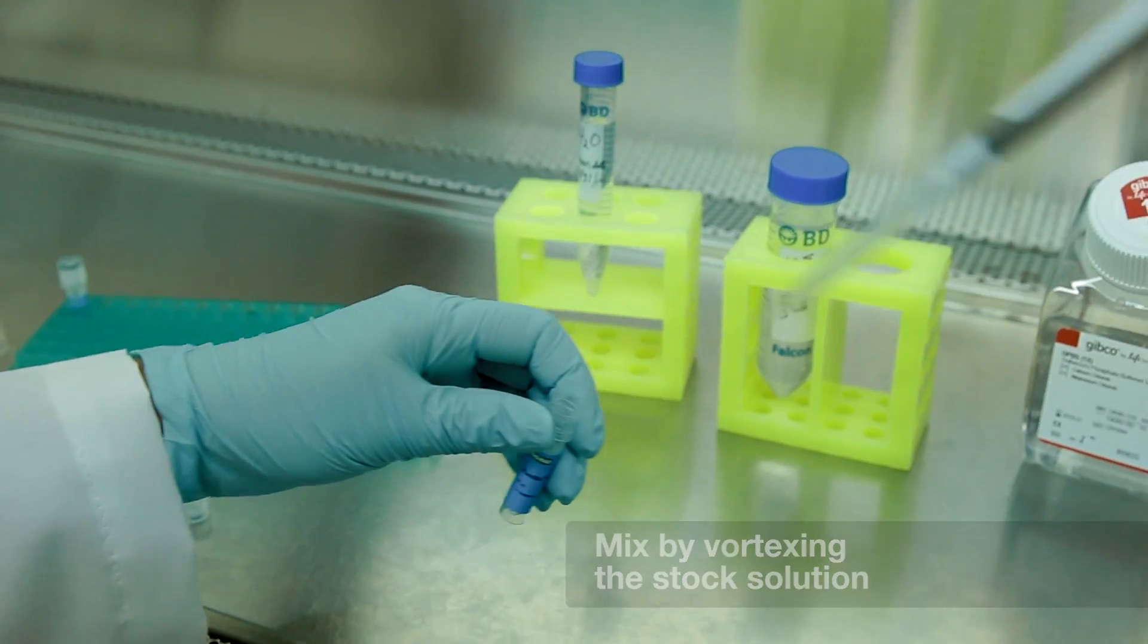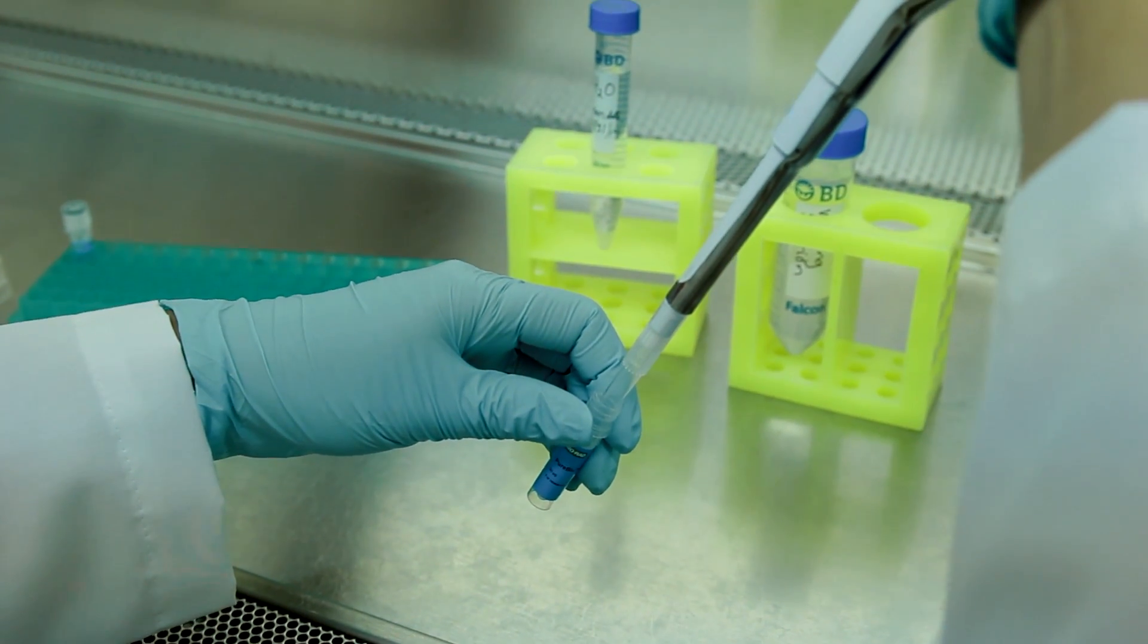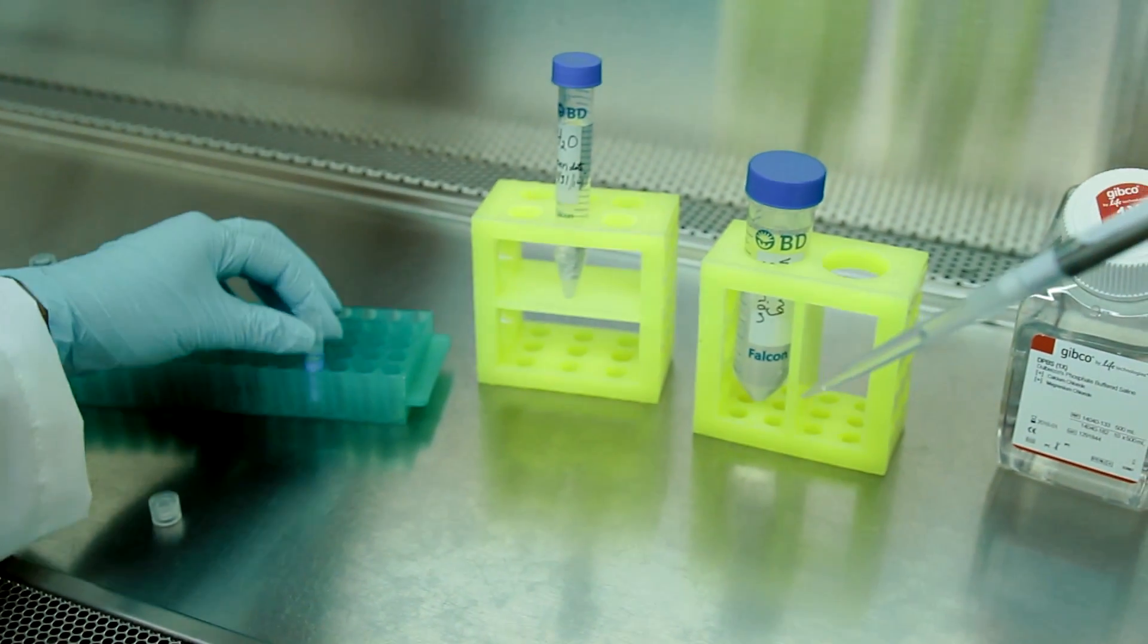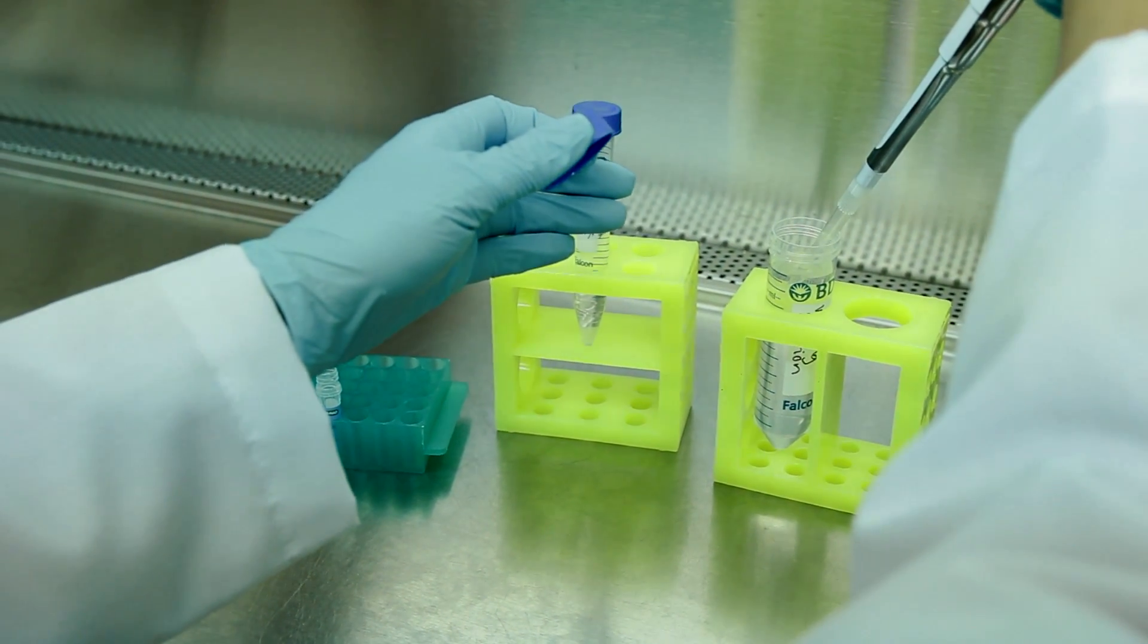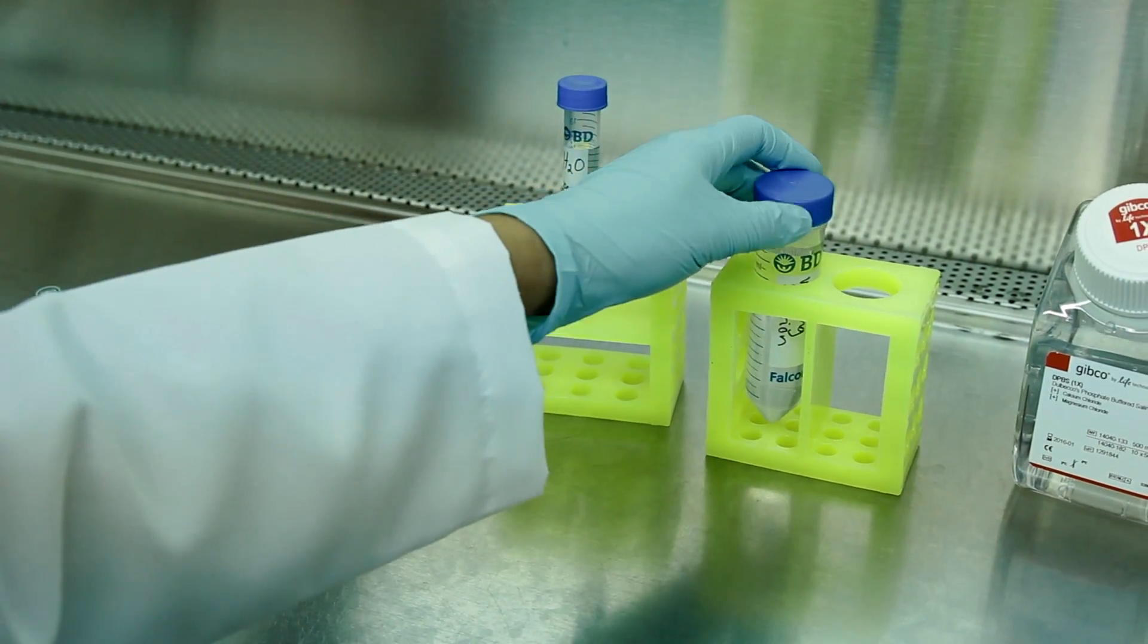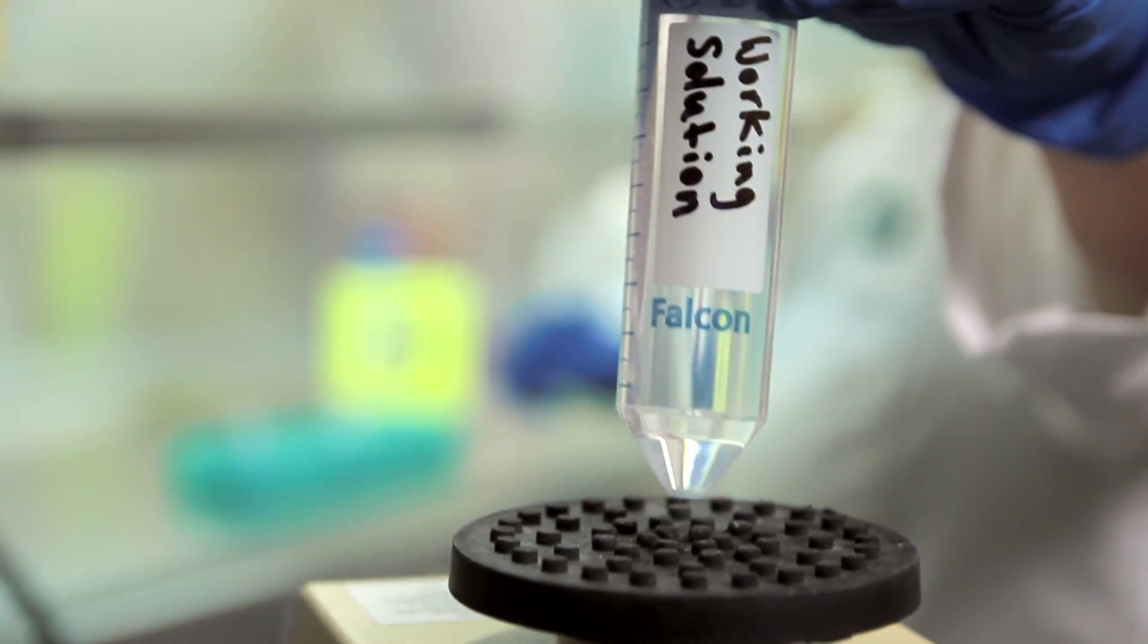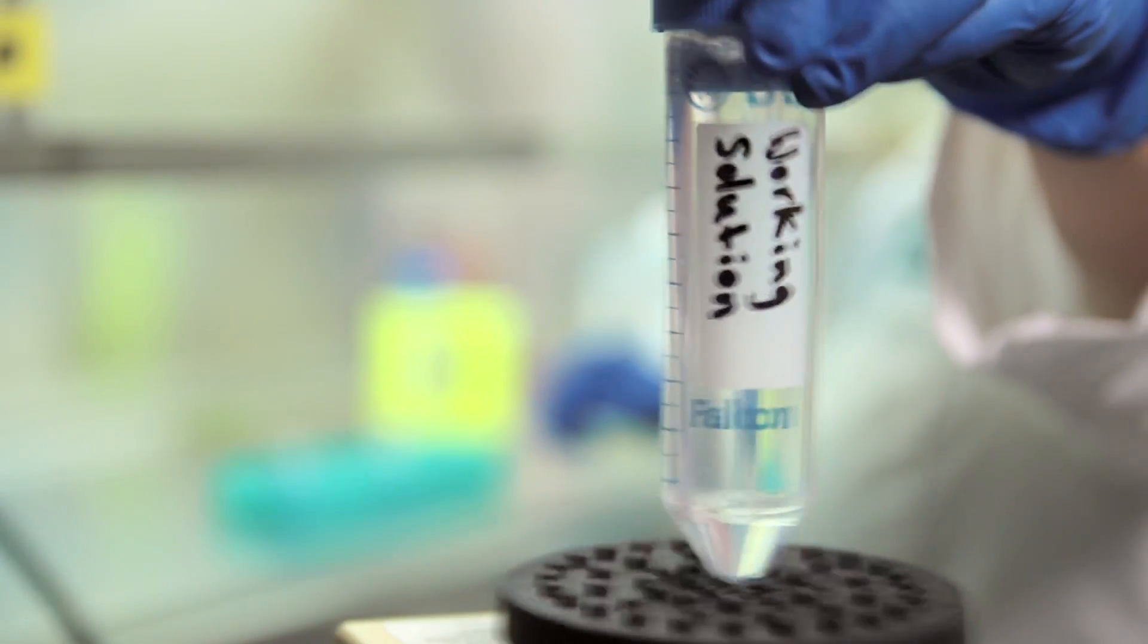Add the 500 microliter stock solution to a 50 ml conical tube containing 49.5 ml of 1x PBS to generate the 1 microgram per ml working concentration. Then, mix by vortexing and set the solution aside.